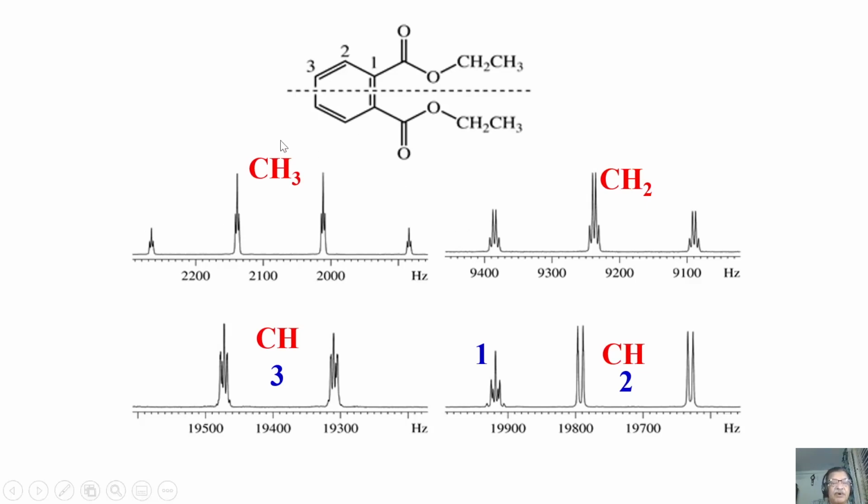Look at this CH3 carbon. This CH3 carbon is a quartet because of one bond CH coupling. This is a big quartet. And these two protons also coupled to this carbon, long range proton carbon coupling. Then what is happening? Each lane of this quartet is a triplet.